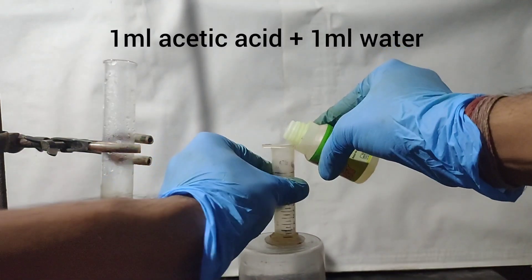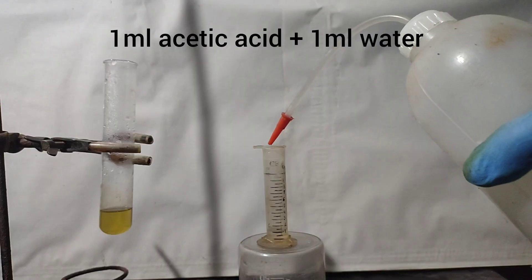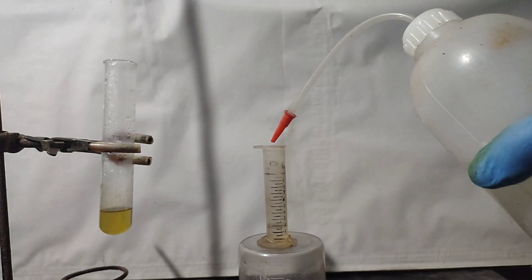Meanwhile, I prepared a 50-50 mixture of glacial acetic acid and water by taking 1 ml of glacial acetic acid and mixing 1 ml of distilled water into it.